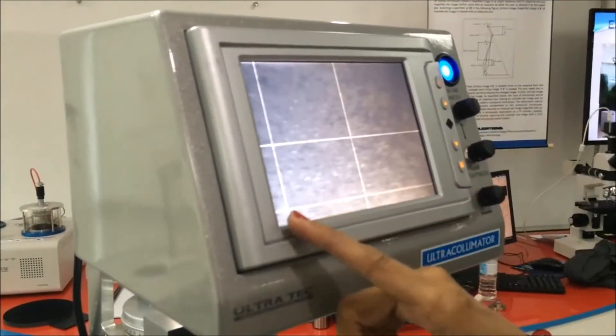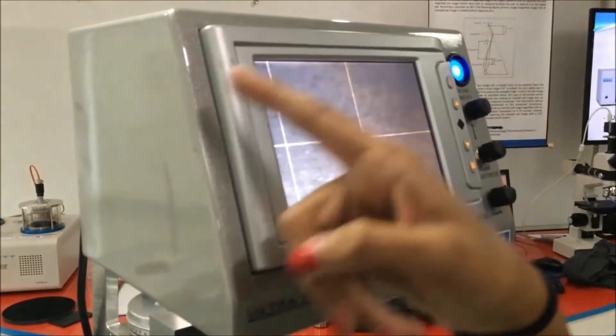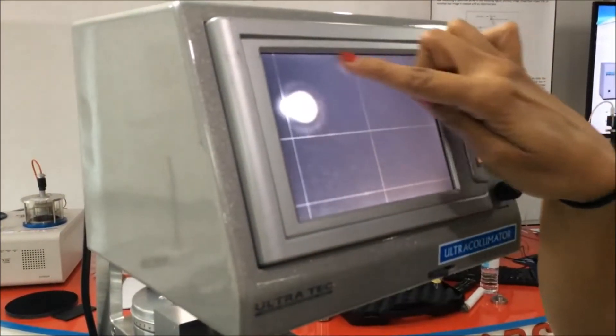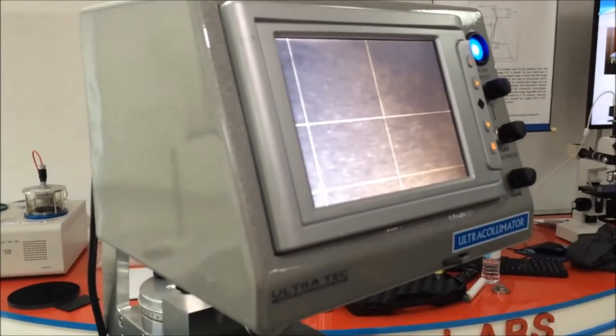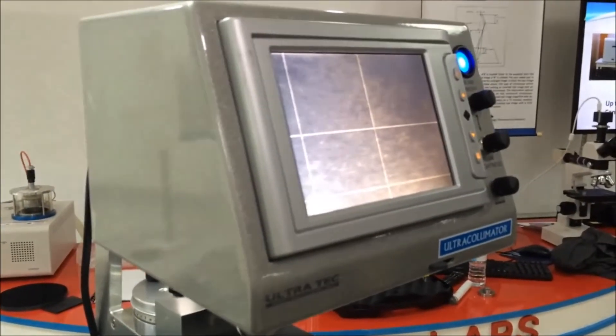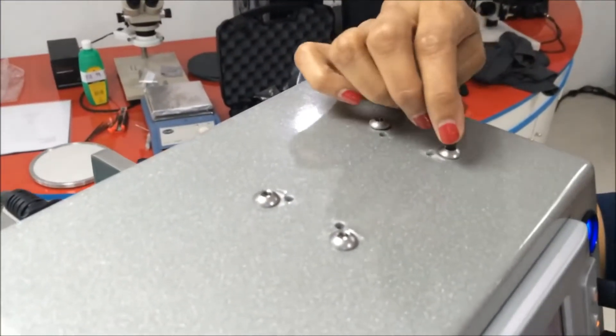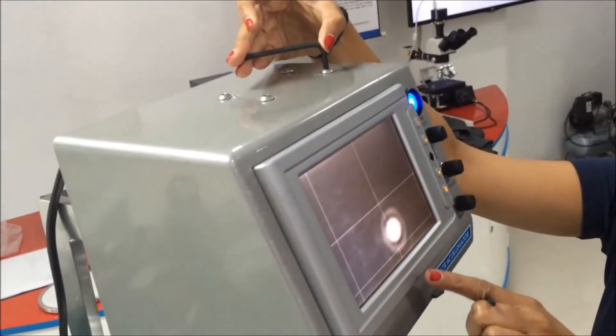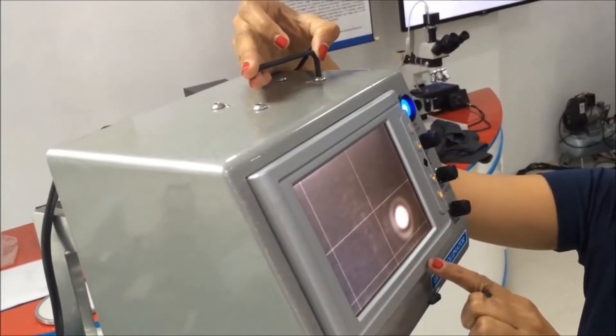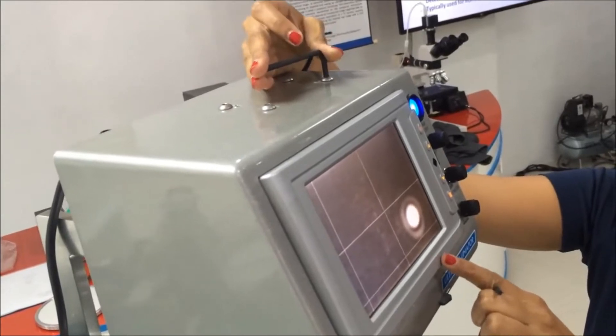So the first thing you need to do is have this circle that you've seen circle inside here. So to do that, you can turn the rotation off when you see it and use the top set screws to move the dot more inside of your screen.